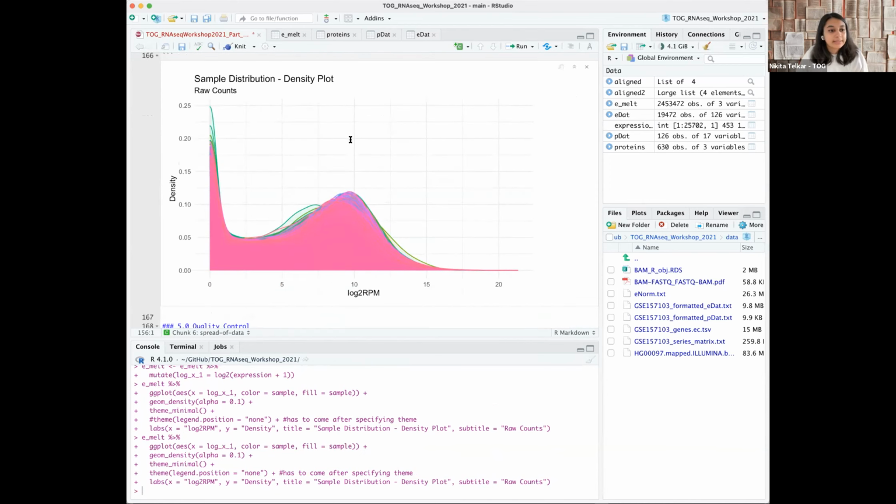And this is what we see. Okay, so just looking from this, I'm going to open this up to the audience. Is anyone brave enough to just tell me what they see over here, or any conclusions you can draw from this? Okay. Is it like normal distribution, but also left skewed?